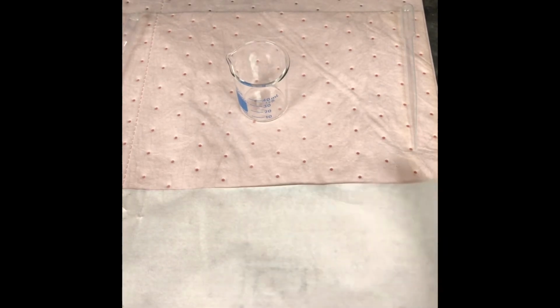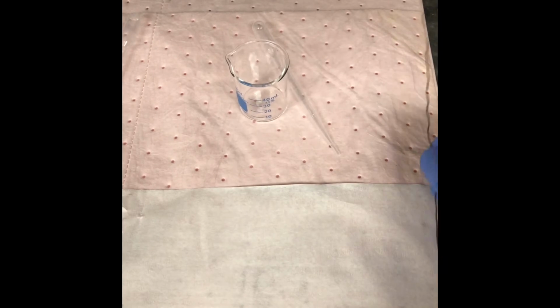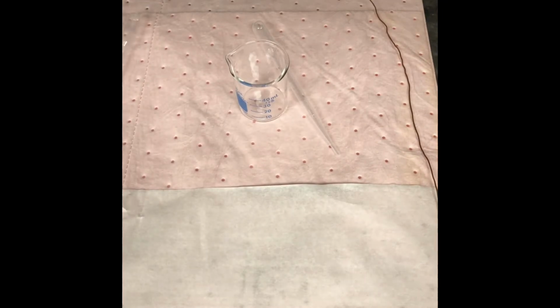Once that's produced, I will pull that out using a copper hook. The copper hook is right here, okay? Now, when I do this, I'll need to add some external base because there'll be a lot of HCl given off, and we don't want to neutralize the primary amines. So this will be a strong base that will neutralize the HCl given off. Part of your questions post-lab is what bonds are being broken and what bonds are being formed. So look at it carefully so you account for all the bonds broken and all the bonds formed.